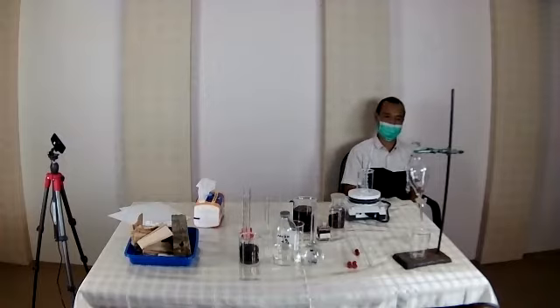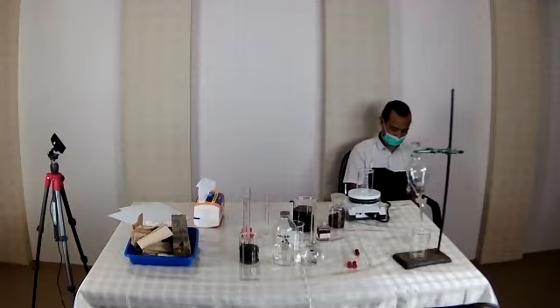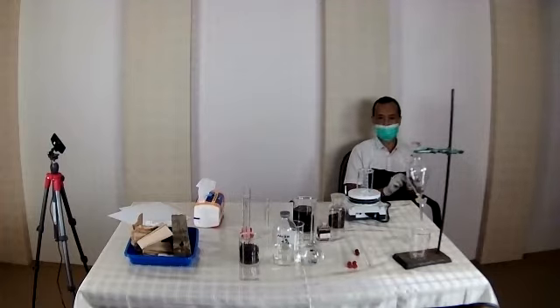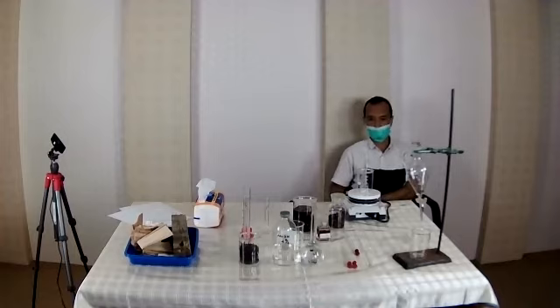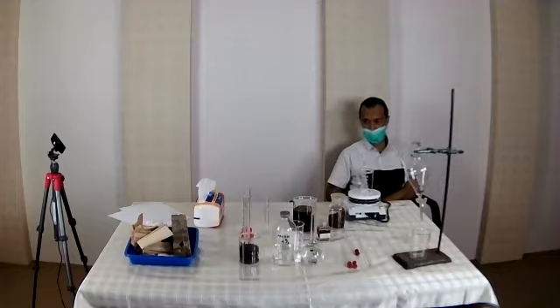I think I don't need to introduce him anymore because he has been with you, all participants, for the last 5 days. Yesterday, Mr. Nahar already talked about traditional conservation methods in Indonesia, and today he will show us some of them. Today the materials to be used are tobacco, cloves, and dried banana stalks.